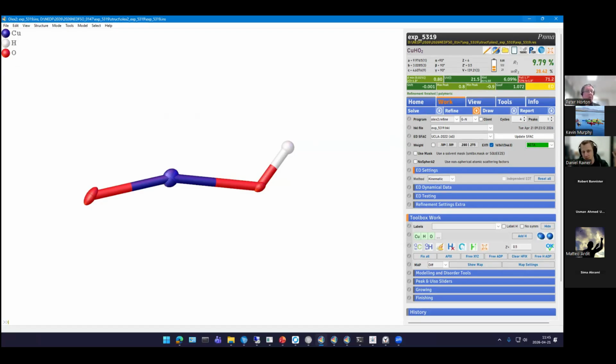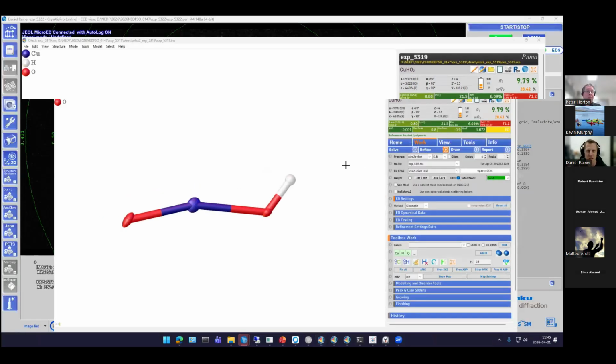But with electron diffraction, it's possible to go to each of these particles individually and hopefully determine the structure of each of them, so that then one is able to distinguish between different phases. So even if there are several phases in one sample, that is also found in nature. I mean, this is a natural sample, this is not synthesized, right? Yeah, there's at least a possibility to get all of these phases.